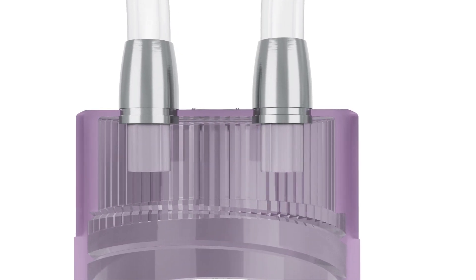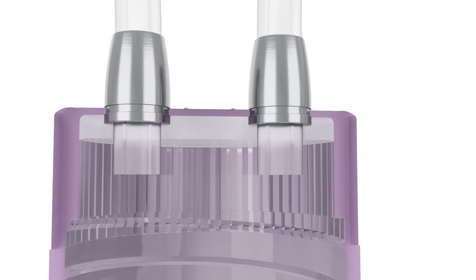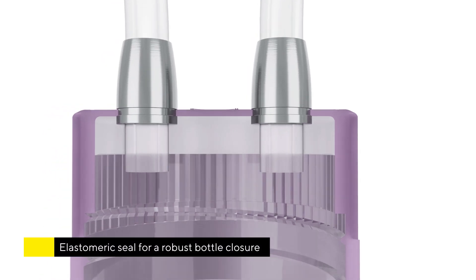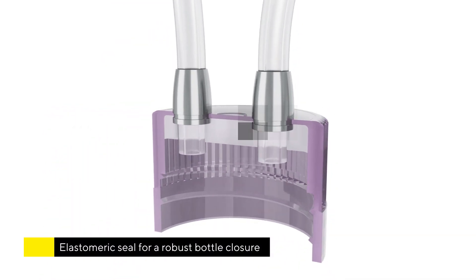Once all tubes have been installed, platinum-cured silicone is dispensed into the cap, encasing the metal collars and creating the elastomeric seal for a robust bottle closure.